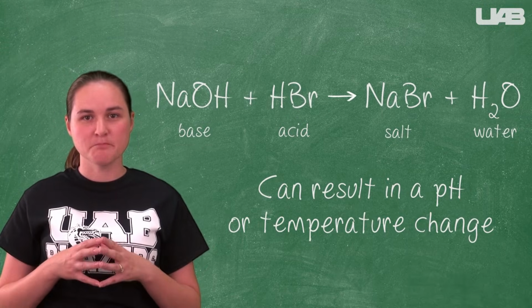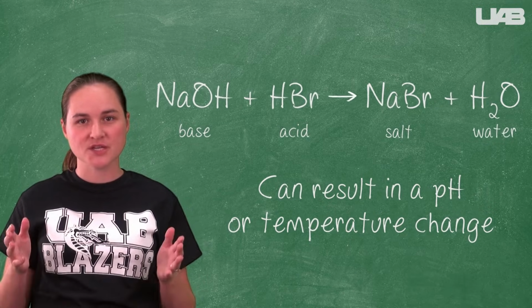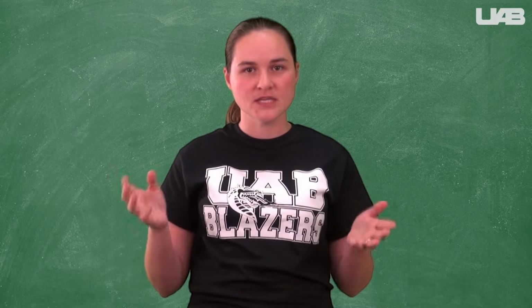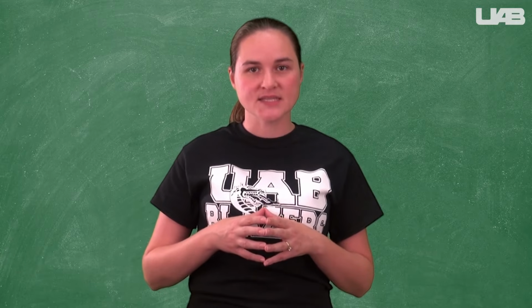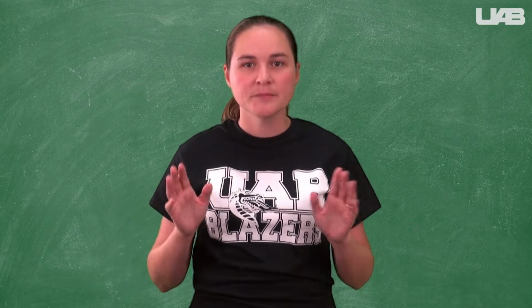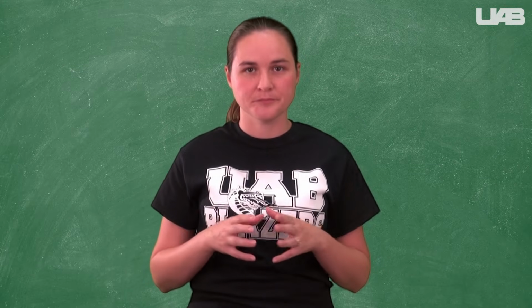Acid-base reactions may not produce a visible change, but they are more likely to result in a pH change or a temperature change. You should deduce this type of reaction from the initial pH measurements. If you are not sure, then you might scale up the reaction to see if a temperature change occurs upon mixing. pH values after mixing are not a good indicator, as mentioned before.